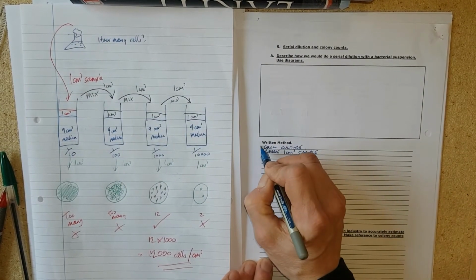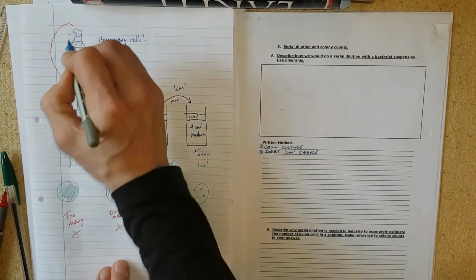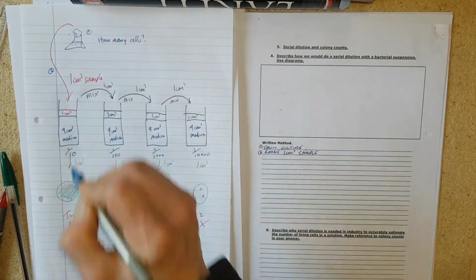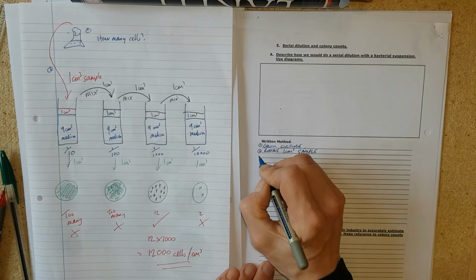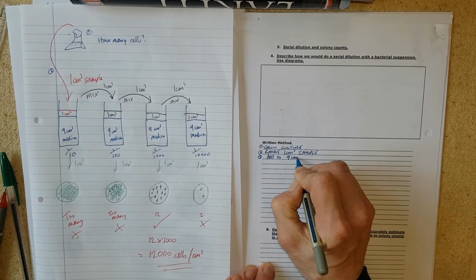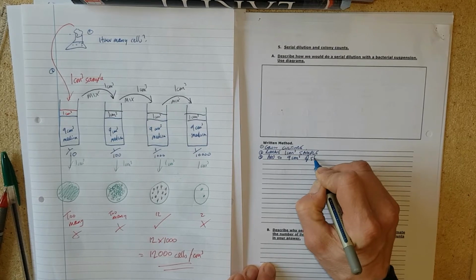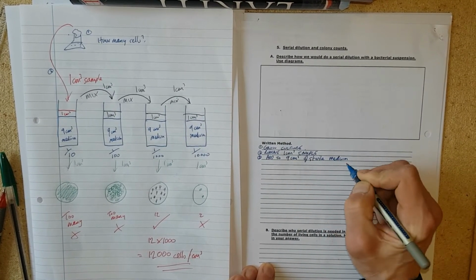So let's just put some numbers on here. So 1 is grow the culture, 2 is remove the 1 cm cubed sample, 3 is add to 9 cm cubed of sterile medium.